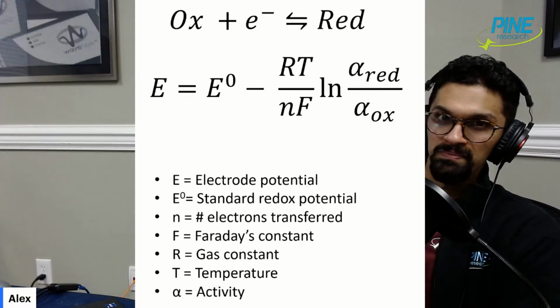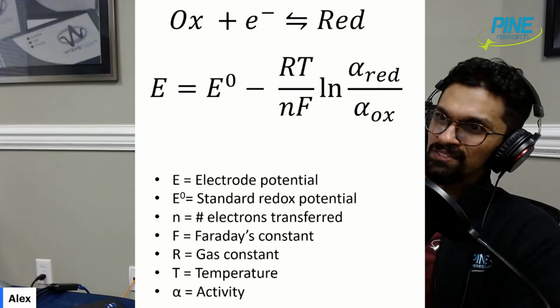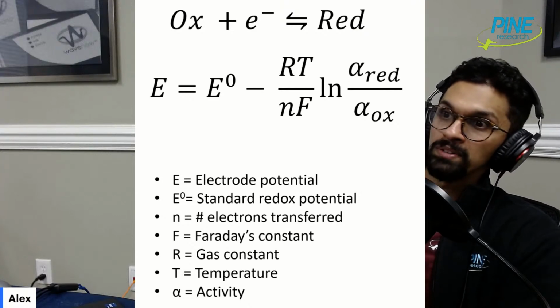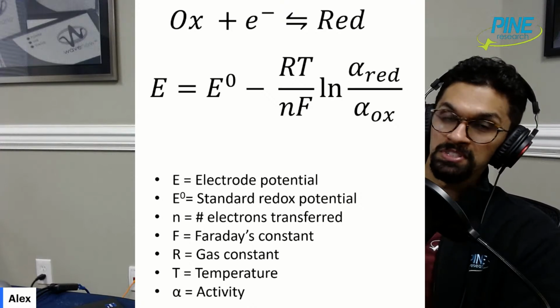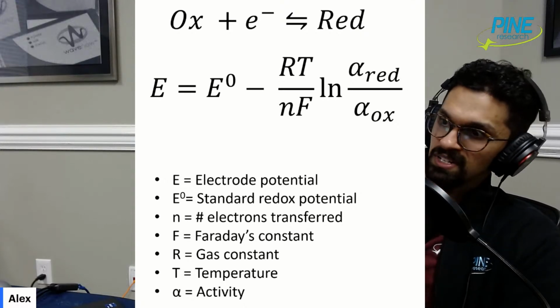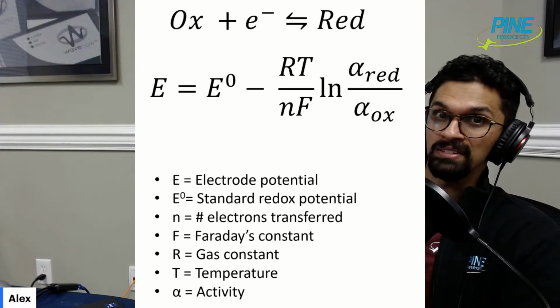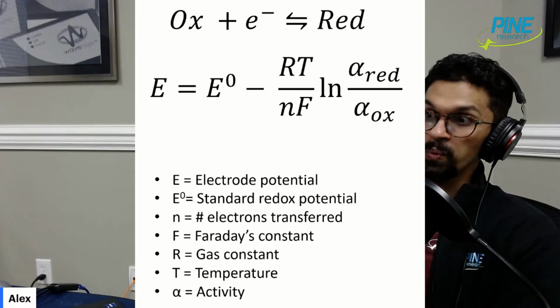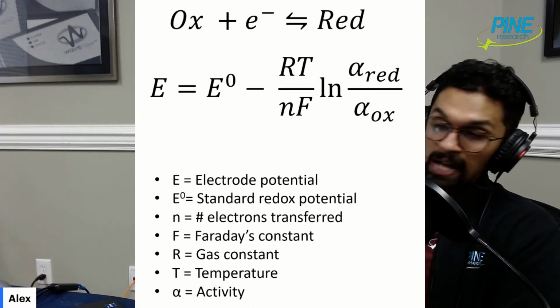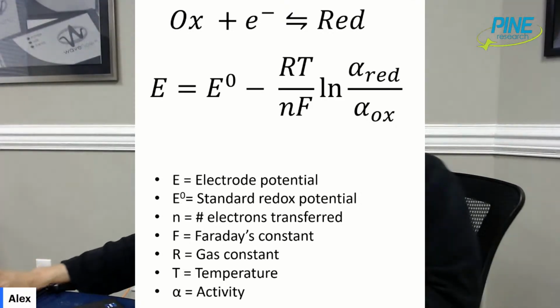Of course, if your reference electrode does not have that as part of the internal fill solution, and it's in 0.01 molar or 0.001 molar, then, oh yeah, you're going to be shifting by several hundred millivolts each time. So that is something that I would think about and work on, and I don't want to say worry about. But yeah, the concentration has to move quite a bit to make a substantial impact in the shift in the potential.